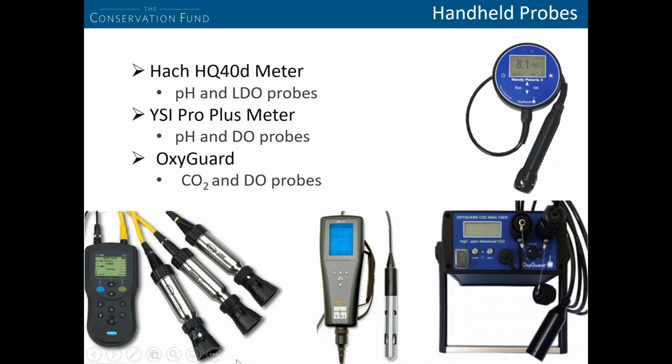By using the stirring beaker, you'll get a result in 10 minutes, whereas if you are putting the probe directly in the tank and you have low velocity, it can take hours for the CO2 probe to equilibrate and provide an accurate reading. It's also important that all of your probes are handled with care, especially the CO2 probe. You don't want to let it hit against the side of your tank, and you always want to keep the tips of your probes free of any buildup or scratches.